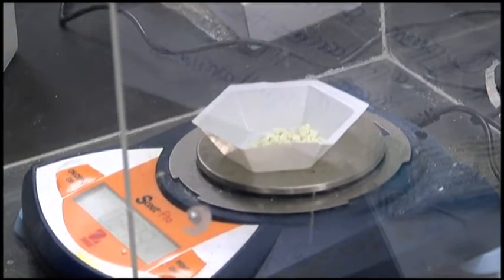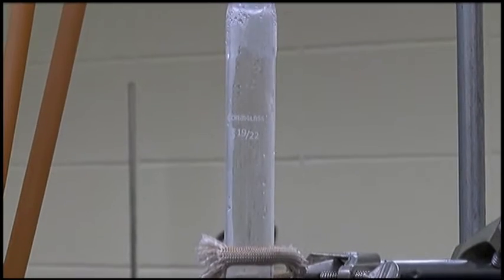McAllister, who joined the project this spring, says it's still early in the experimenting but already they've been able to see positive results. We've gotten some of them to work, but others it's better off just refluxing it, so we've made progress but there's more to learn.